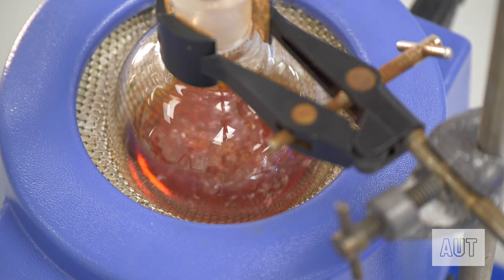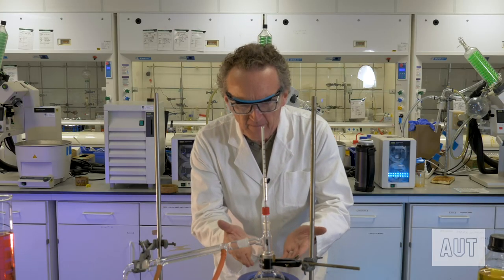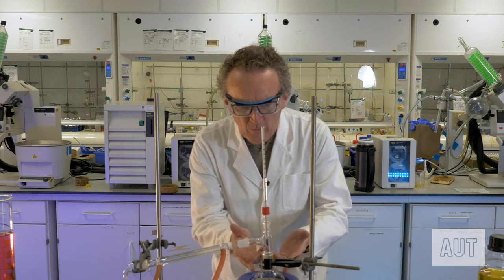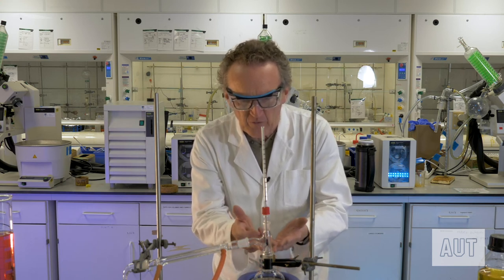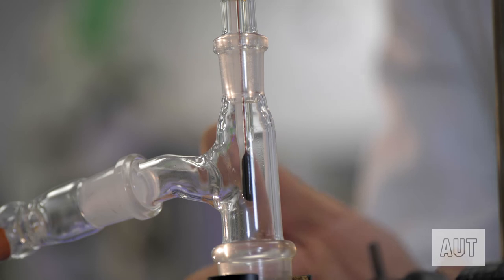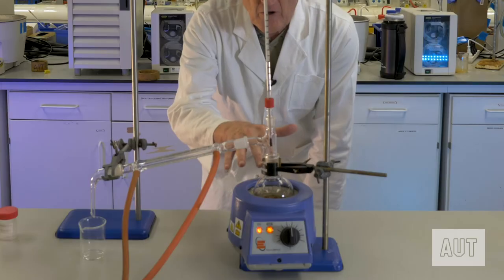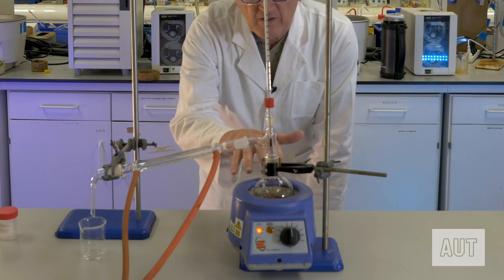Okay, welcome back. Things are happening here now. We've just started to boil. So what will now be happening is that the hot vapor will be coming up and it will be heating up all of this glassware, which at the moment is fairly cold. So the vapor just doesn't come straight up and condense. It's got to heat up all of this glassware to the same temperature. So we're boiling quite vigorously now.